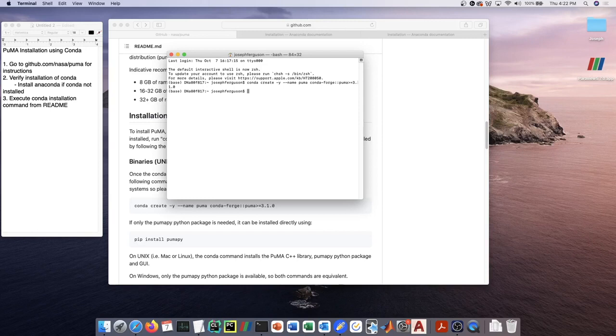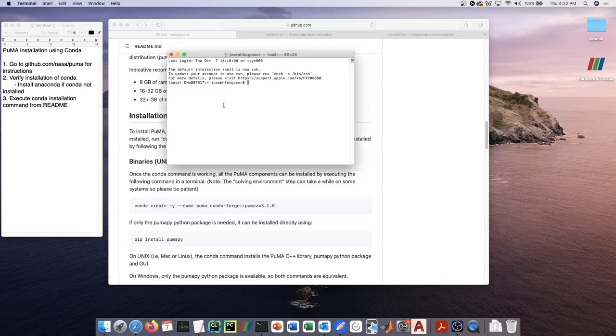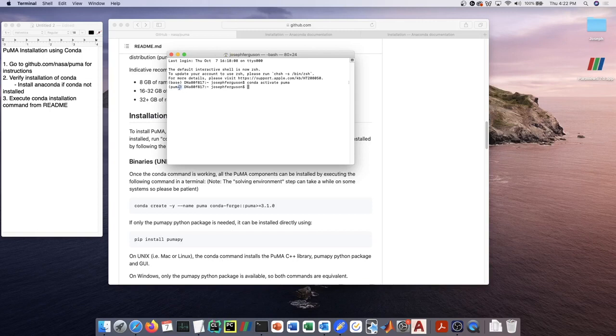I'll just open up a fresh terminal to show you. Just open up any terminal, you say 'conda activate puma'. Now the environment here on the left is showing 'puma', and then you will just type in 'puma gui' and hit enter.